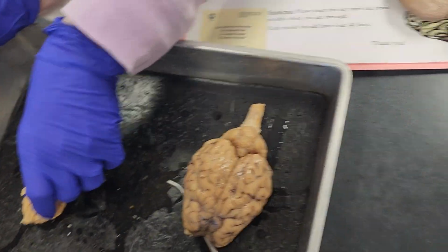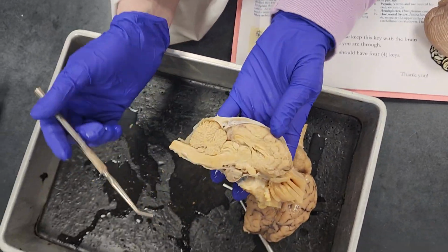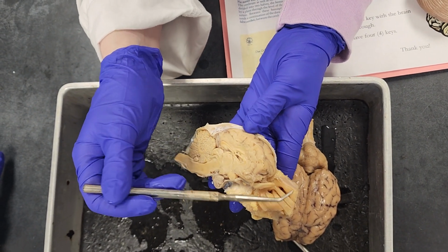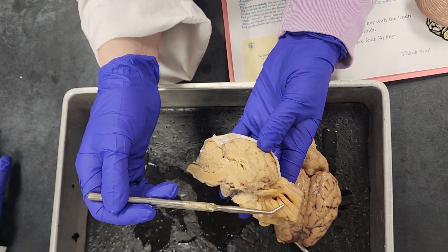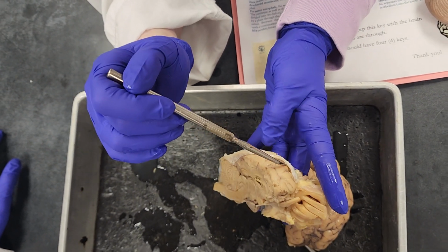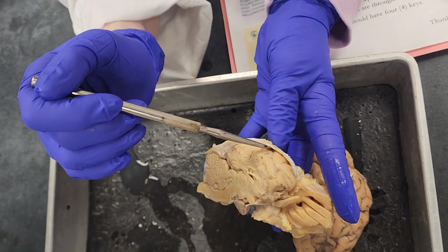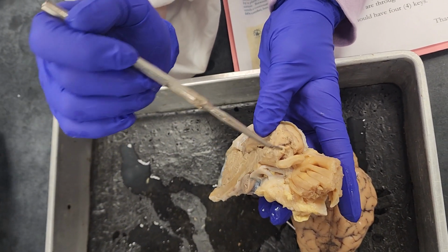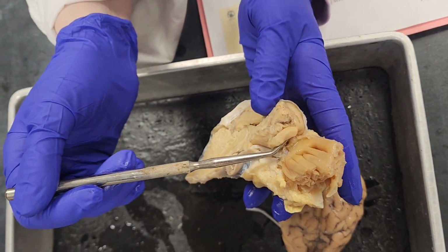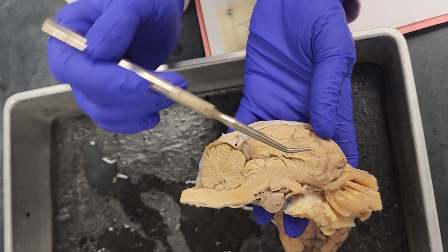Okay, so moving over to this. This is a brain that's been cut in half down the longitudinal fissure. This stuff up here is part of something called the ethmoid plate, part of the skull. And they leave it on because it really holds on to this dura, the meninges, which is this membrane. We'll come back to that. So here's that olfactory bulb that you can see on the underside of the brain. It's just one side.